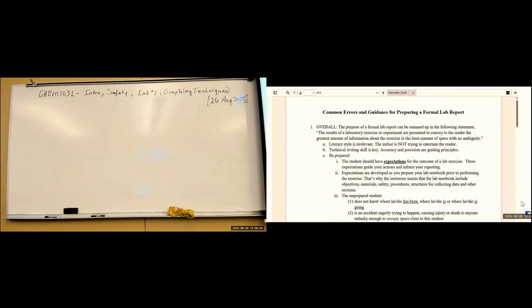Setting up your lab notebook. This is an example of a student writing legibly. These notebooks don't have blank pages in them. If you look at the top, you're going to see the numbers are in order, but not directly sequenced, because we left out the blank pages.